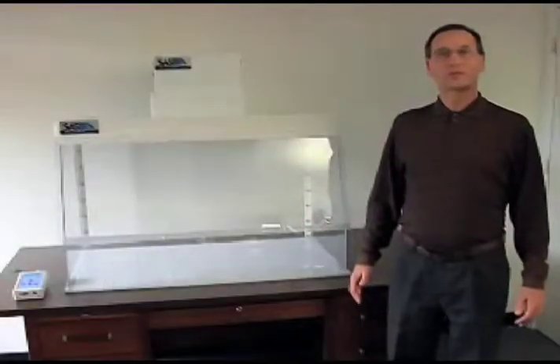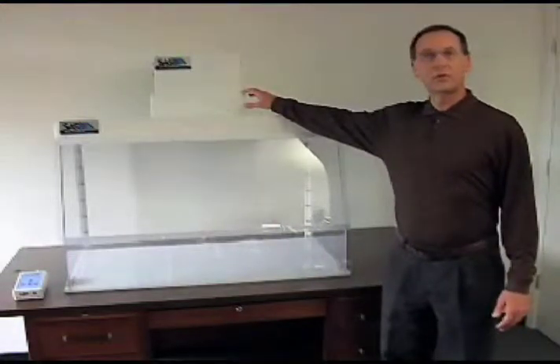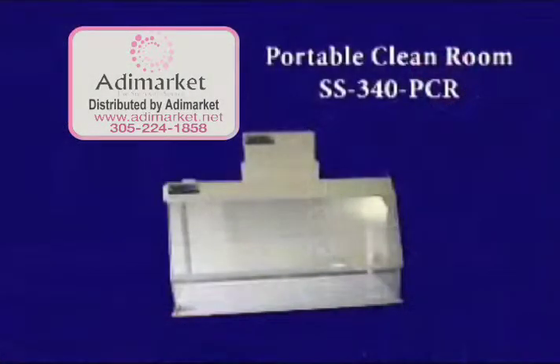We're here to show the performance of the Sentry Air System's Model 340 PCR portable clean room. The purpose of this device is to provide a portable clean room for areas where a clean air zone is required.